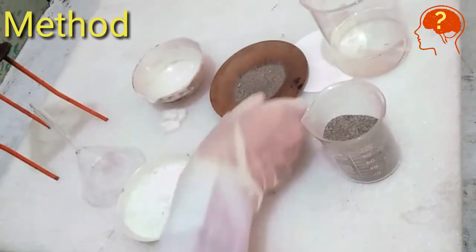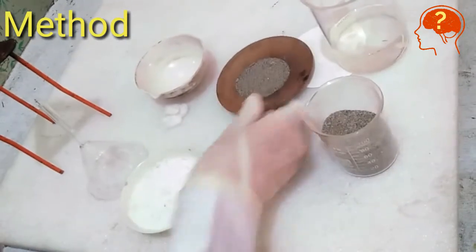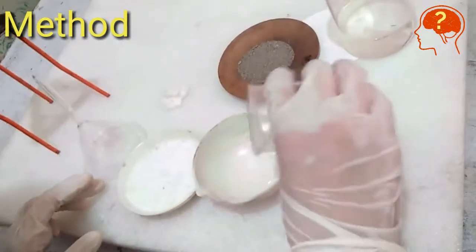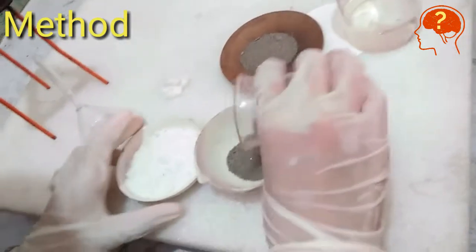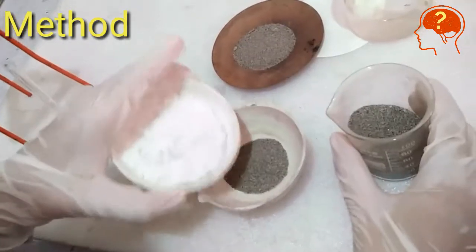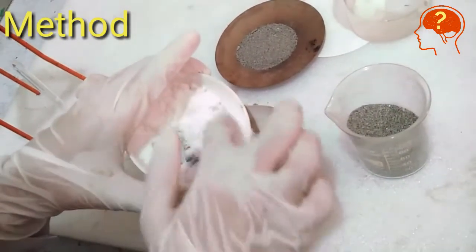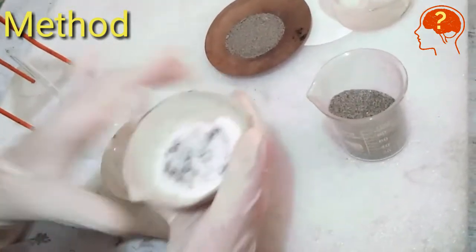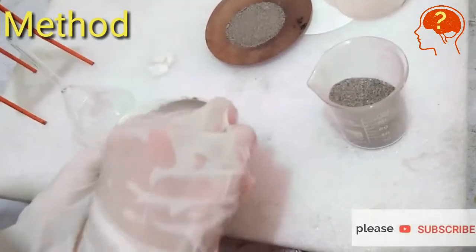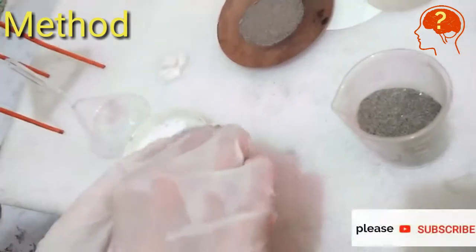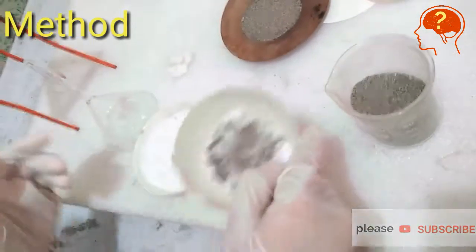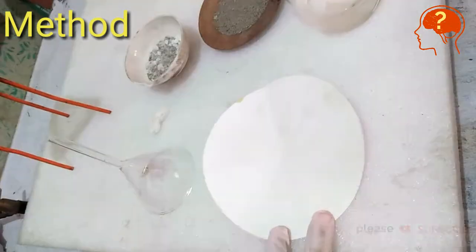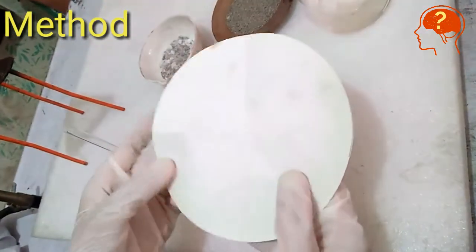Now she is adding sand in sand bath. Take china dish and make the mixture of sand and naphthalene. Add a few grams of sand and a few grams of naphthalene to make a mixture. Now she is going to make a filter paper cone.